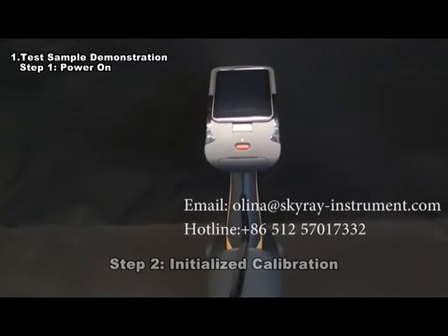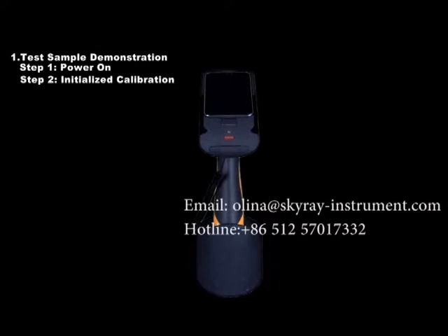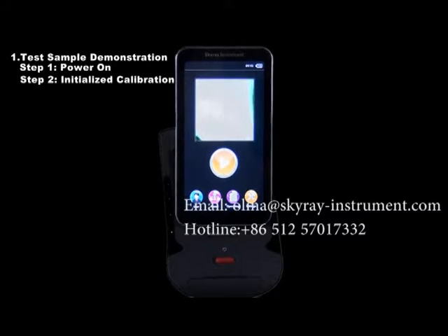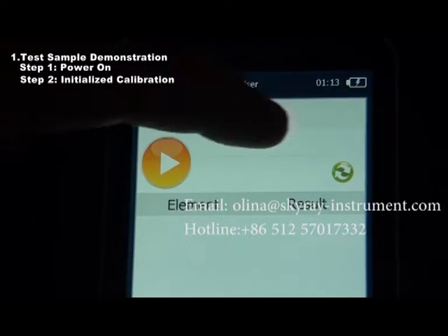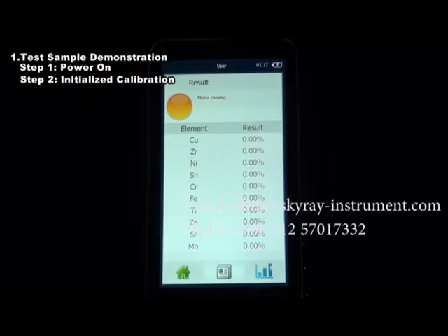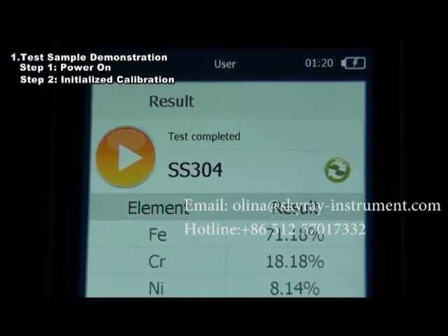Step 2: Initialize the calibration. In the event that the instrument is used for the first time, or reused after being put aside for a long period, complete the initialized calibration. Generally, one initialization per week is sufficient. On the main interface, click Test Results and then click the Initialization button. The green instrument indicator light changes to red flashes while the instrument is being initialized. This process usually lasts over 10 seconds.